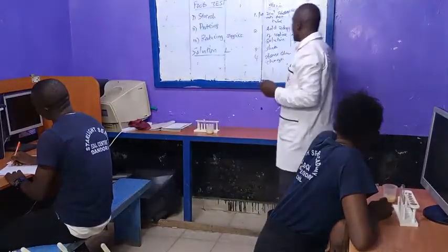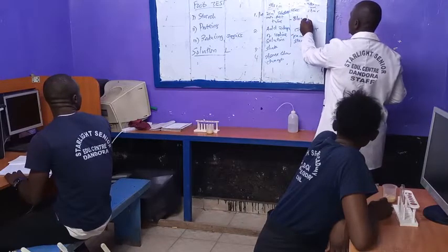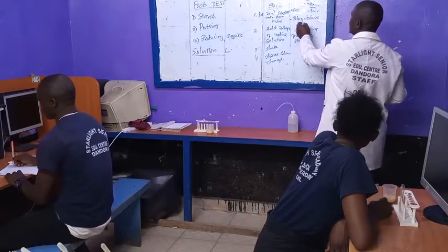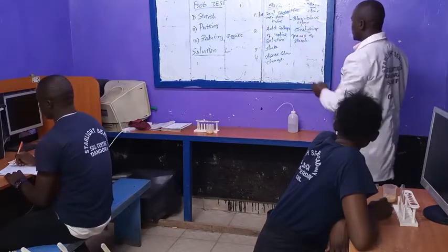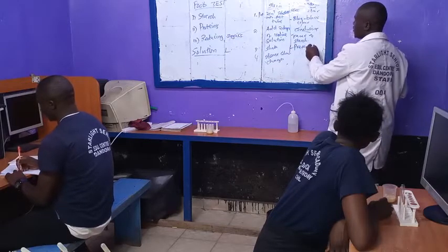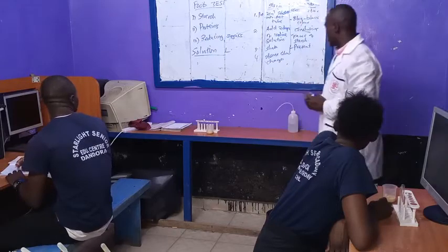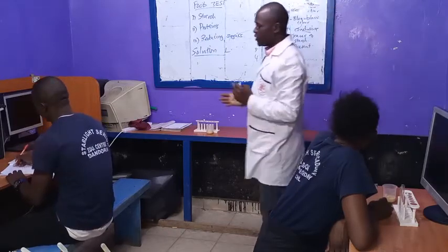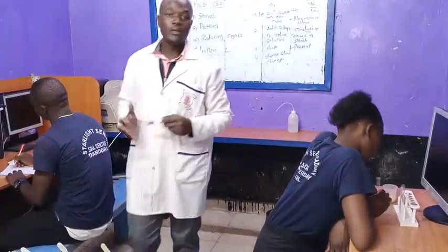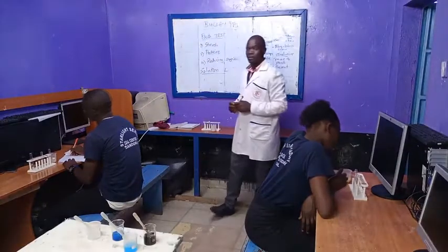So ideally, when you observe a blue-black color, when the color changes to blue-black, then we expect our conclusion will be starch present. Our blue-black color will be starch present. Of observation, if we observe blue-black, then the conclusion should be that starch is present in the food substance.